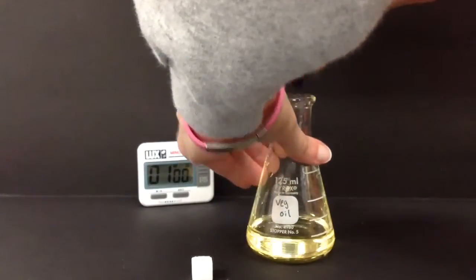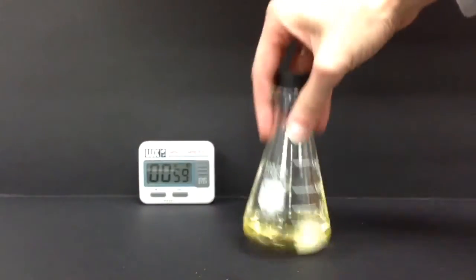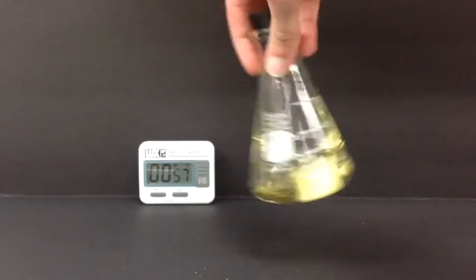The final solvent is vegetable oil. Watch closely and be careful with your observations. Some of the little specks you see are air bubbles from the swirling.